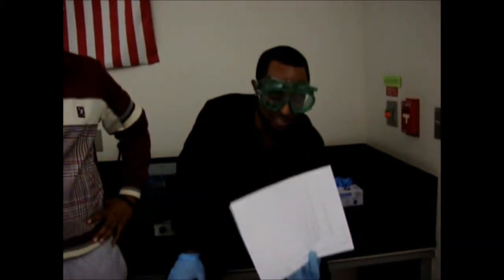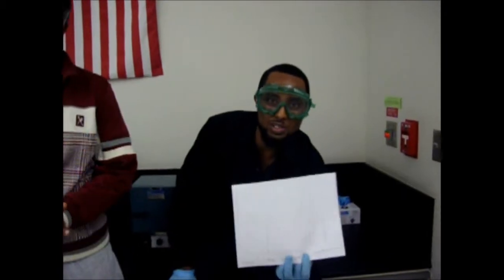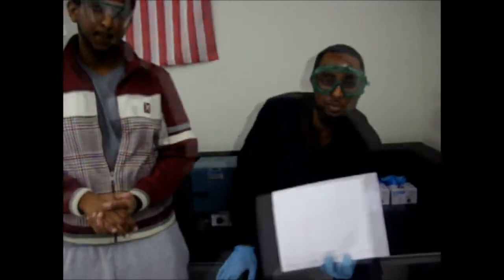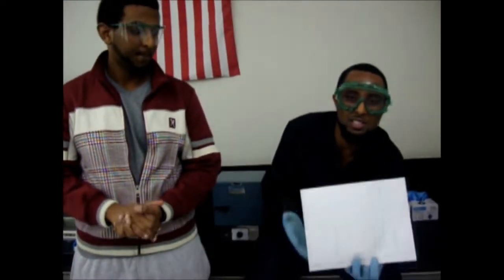Nice. And this is the most powerful tool that we had for identifying what our compound was. We could have started with this and finished with this, because it gives us all the information that we could have used to identify Lidocaine, because no NMR for any compound is going to be similar. So we could have finished with this and started with this.